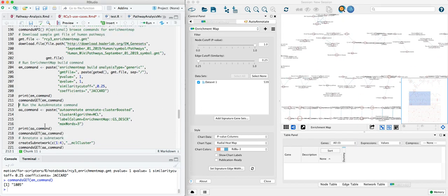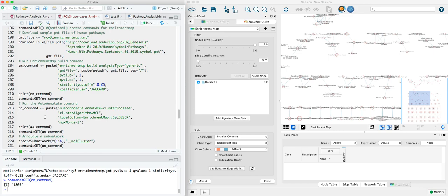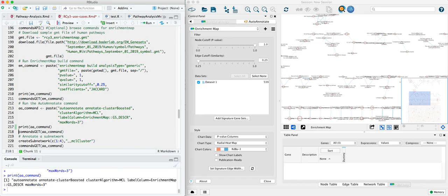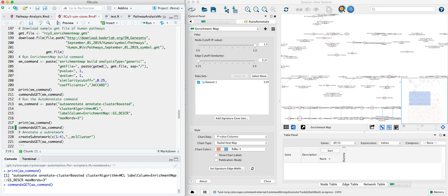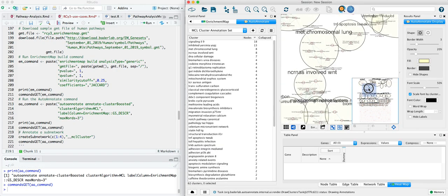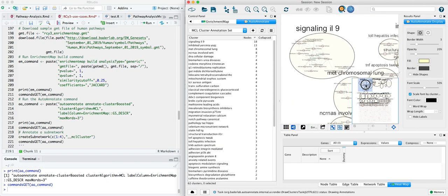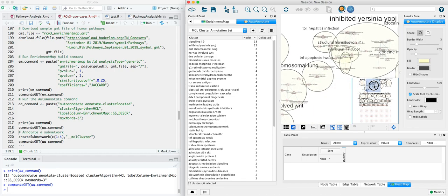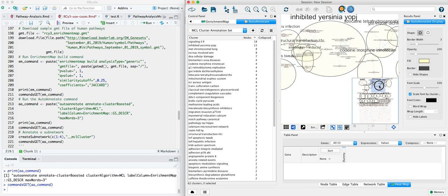The next command annotates these collections using auto-annotate and word cloud. So again, we'll construct the command syntax. You can print it out here to take a look at it. We'll reuse it directly if you want. And run it from RCy3 with the next line. This then uses word cloud assessment of the pathway names to give a title to each of these groupings.